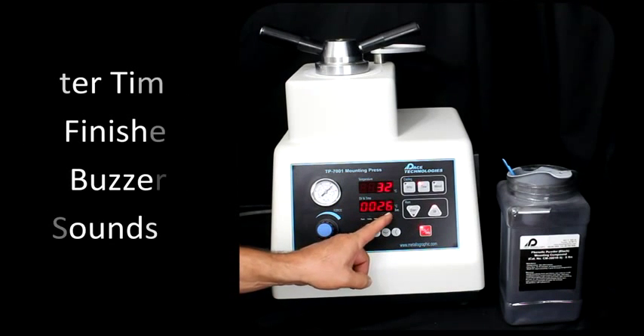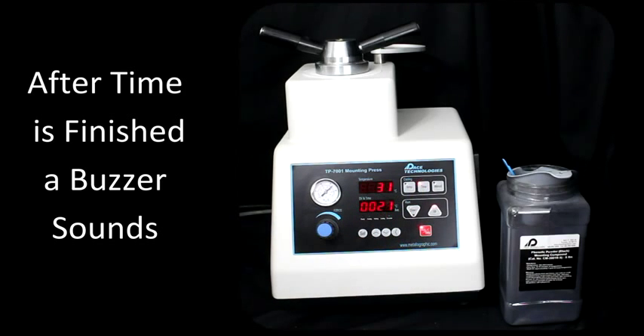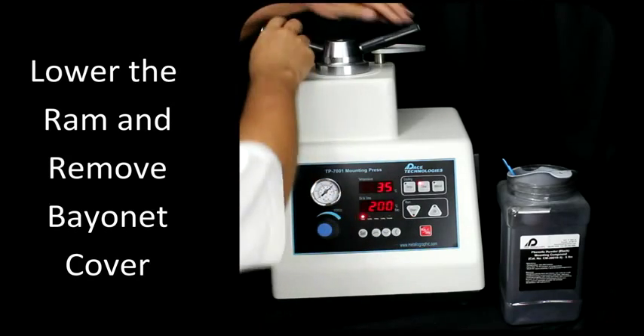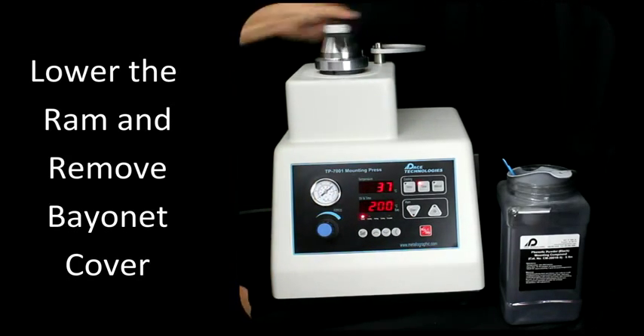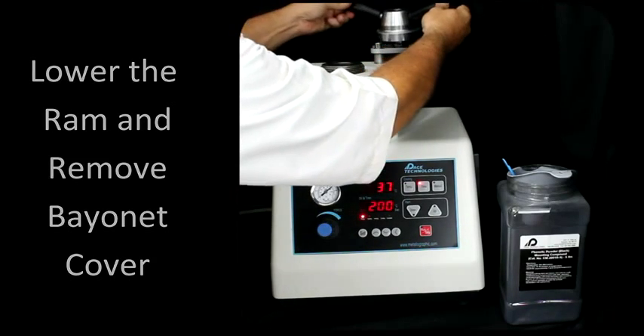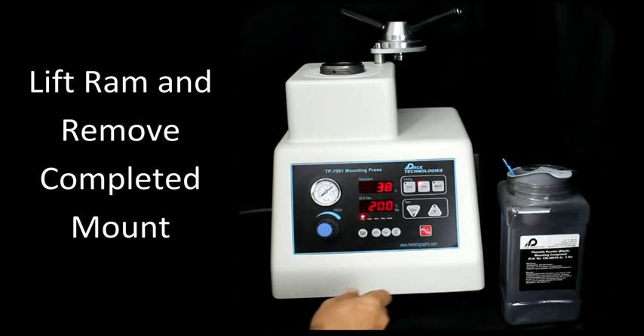As soon as the time counts down to zero, or the temperature is reached, a buzzer will sound to signify completion of the heat. So we're going to go ahead and remove the cycle. Lower the ram. Remove the bayonet cover. Place it over on the side to keep from burning yourself.